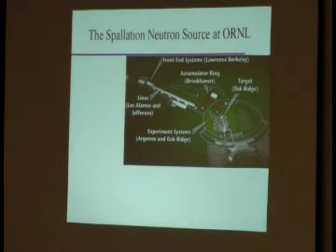This was the design, so they basically had a linear accelerator, and they had their target, once again accumulator ring, and then, well actually that is for their particles that will hit the target, and then you get all these stations around the target. And the target is actually a liquid metal, because then you can dissipate the heat better.